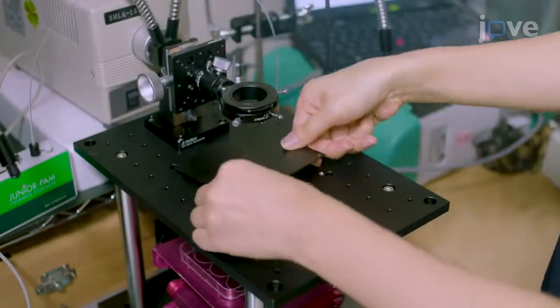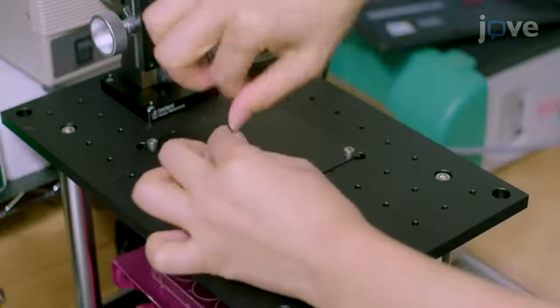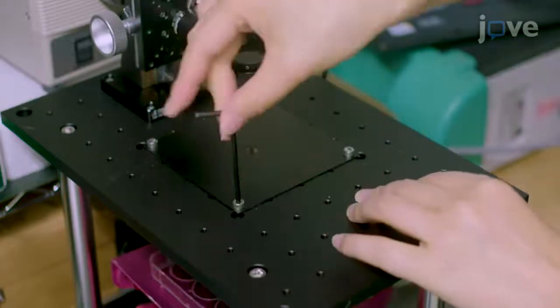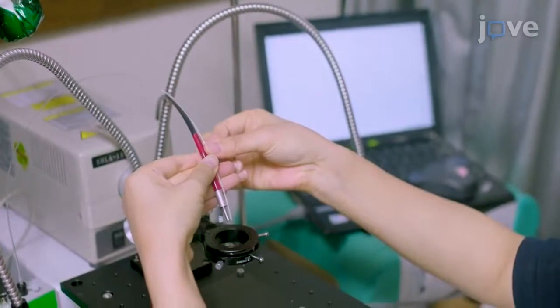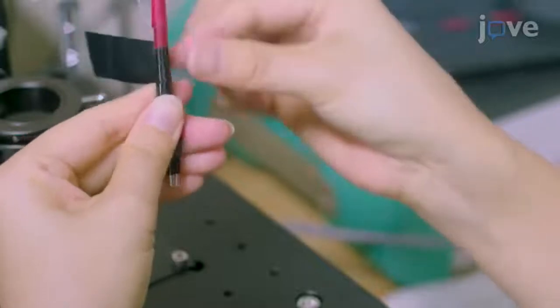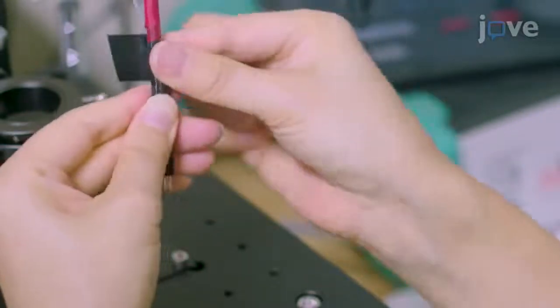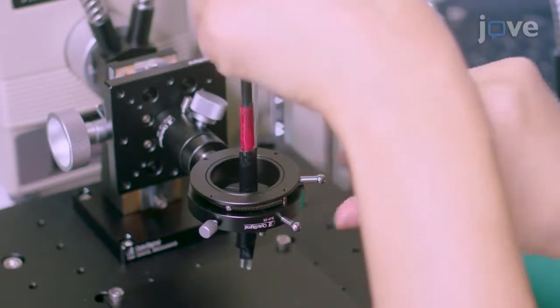Next, attach a 10 cm squared steel plate with a 1 cm diameter hole to the custom-made sample stage, and fit 2 thin fiber probes tightly together. Wrap the probes with plastic tape and use a holder to clip the taped probes onto the sample stage.